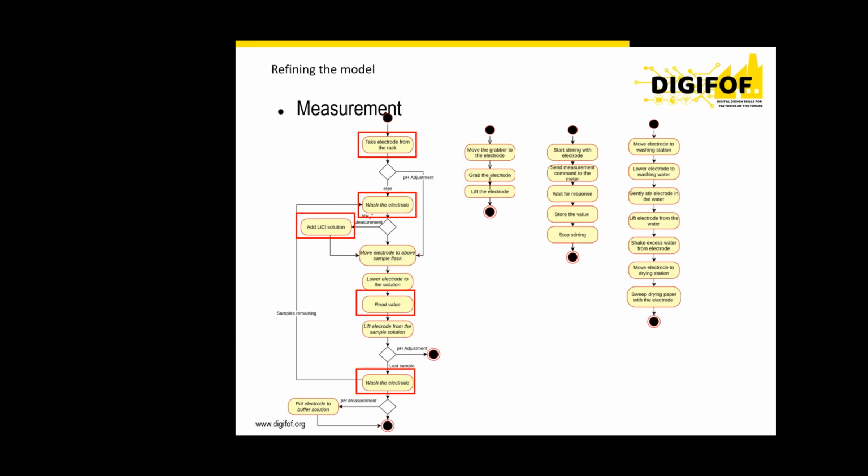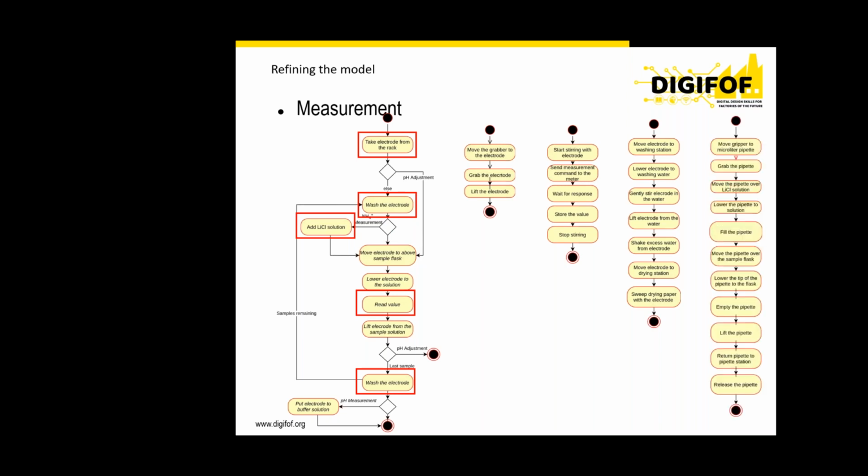Then add LiCl solution. So again, if you follow the lines, it is quite straightforward code as a result. So with this level, we can start creating the executive code.